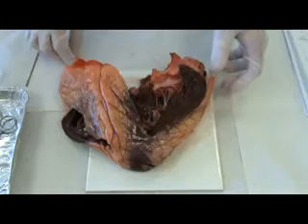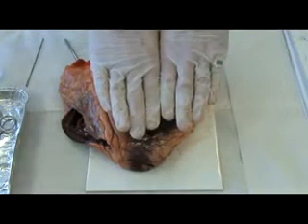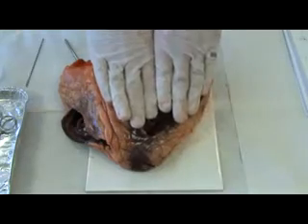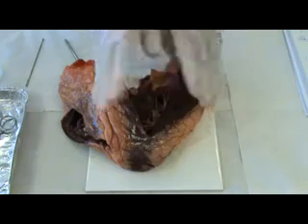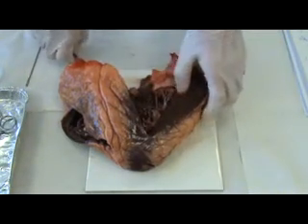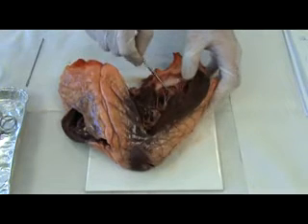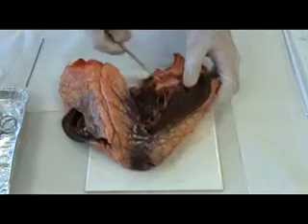And what they're doing is they are allowing the valve to open and then shut. So the blood flows through and then they shut, so they don't flap about. So those valve flaps are opening with the flow of the blood, and the tension provided by the chordae tendineae allows them to close.